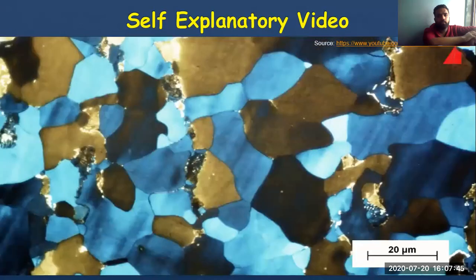And this is the plain carbon steel S235 after a color etching. It only has a low carbon content. The relative amount of differently colored ferrite crystals is high, the proportion of pearlite regions low.